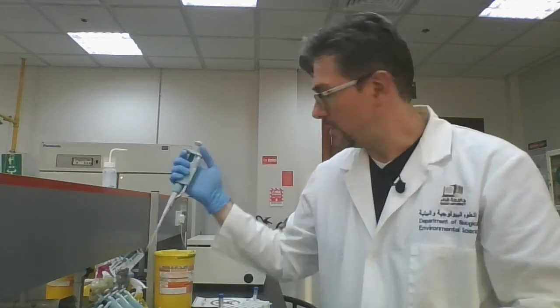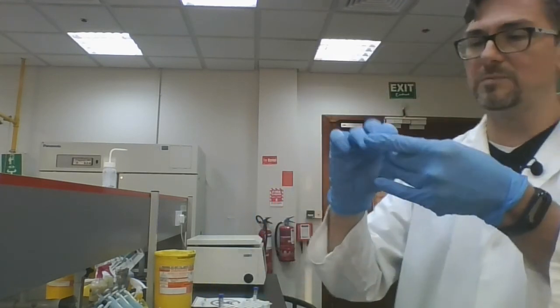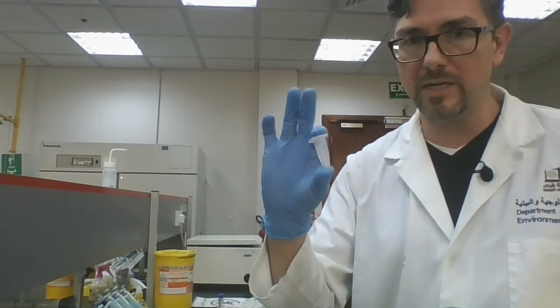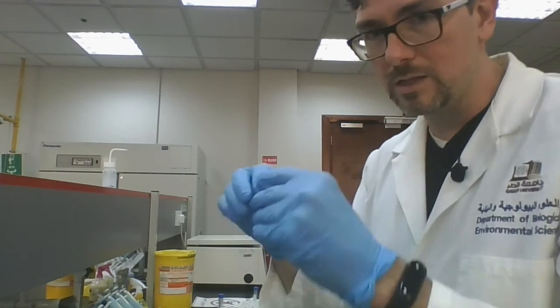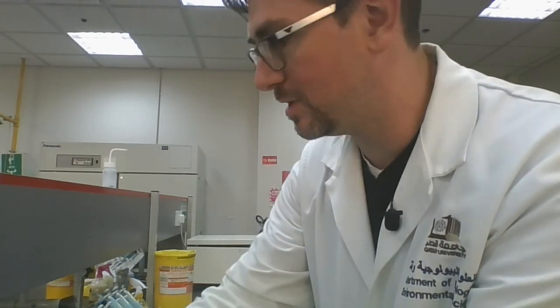Close the tubes. Do not try to resuspend the pellet. If you do, it will never stick back to the side of the tube again. So leave the pellets where they are. You just added some ethanol. Put these back into the centrifuge. Oops. This is what happens in labs. Spills happen. So I have a little bit of biohazardous material on the bench. I'll clean that up while I'm spinning the stuff down. So I'm going to spin for about 1 minute. Okay, so I'll see you guys in 1 minute.